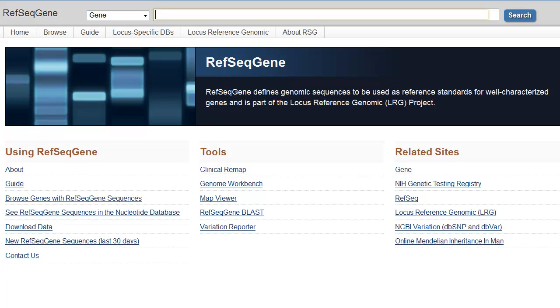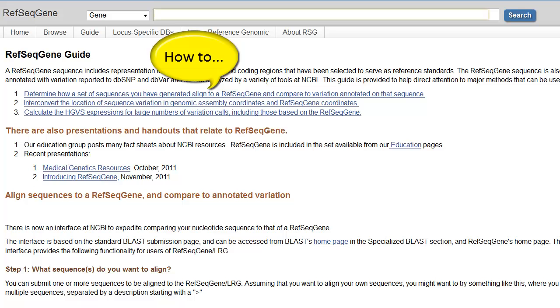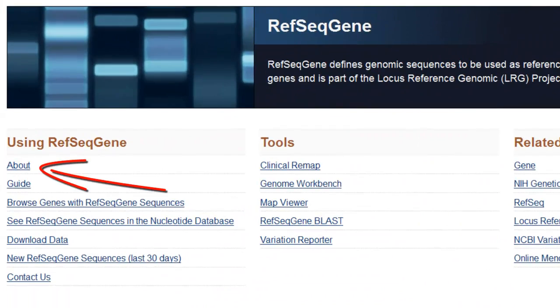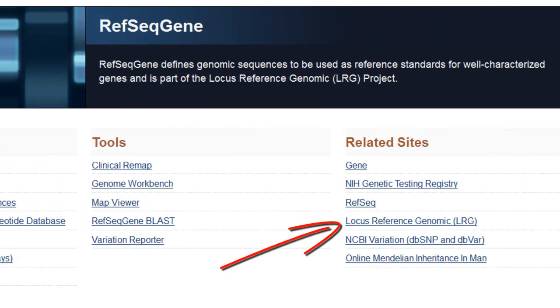That's it for the demonstration, but I'd like to point out a few important links back on the RefSeqGene homepage. The guide page offers a few how-to methods, such as how to align your sequences to a RefSeq gene using BLAST, and slide presentations about RefSeq gene-related tools. The About page provides a history of the RefSeqGene project, and the Locus Reference Genomic page summarizes the LRG collaboration.